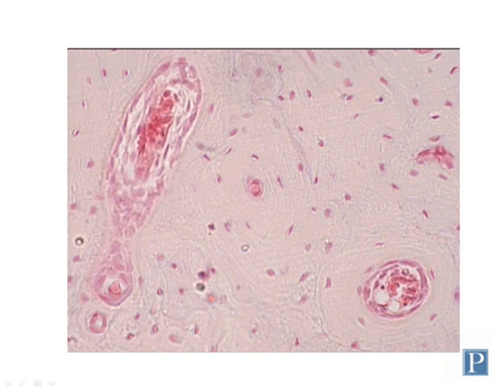Here's an even higher magnification view, and here's a small central canal or haversian canal, which is from an older osteon. And if you look carefully, you can actually see these ring-like structures in the bony matrix here. Again, they're not as clear as when using a ground bone preparation, but you can begin to see the circular nature of these concentric lamellae.